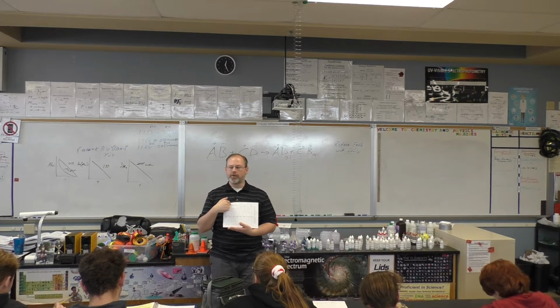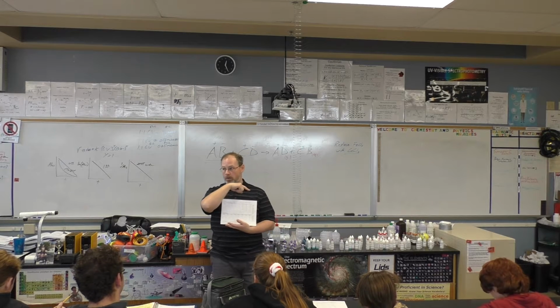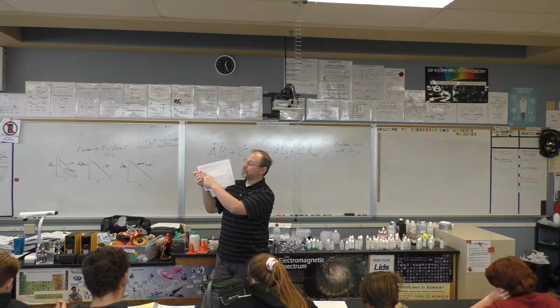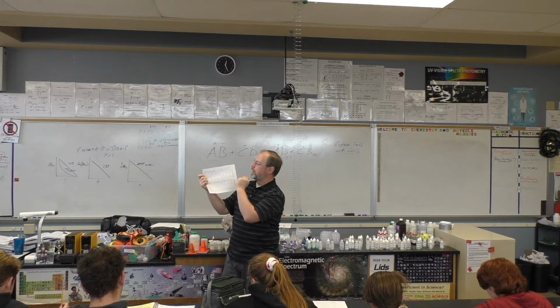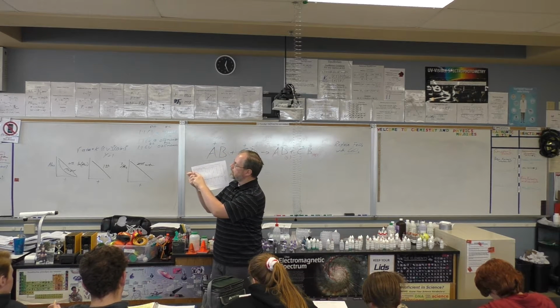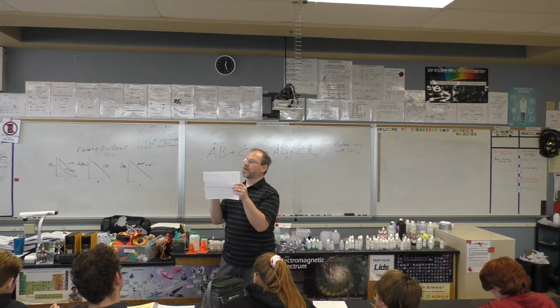In this top chart, you're going to identify what the AD and the CB are. Okay? So you're going to look at the combinations. For instance, in this first box, sodium phosphate has sodium ions and phosphate ions, and silver nitrate has silver ions and nitrate ions. The combinations that AD and CB would be are silver phosphate and sodium nitrate. Does that make sense?